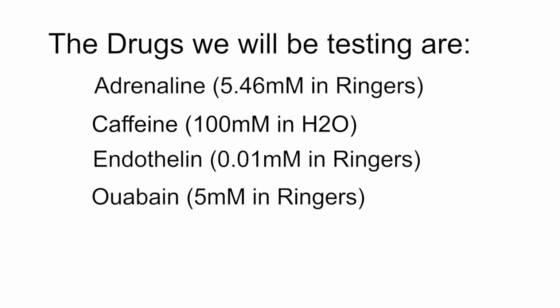Now I think you're starting to get the idea of how we go about measuring the effect of various solutions on cardiac muscle contraction using this equipment, so we won't go into as much detail in this video, but let's have a look at what we're doing for adrenaline.